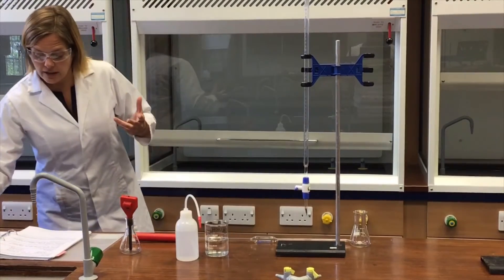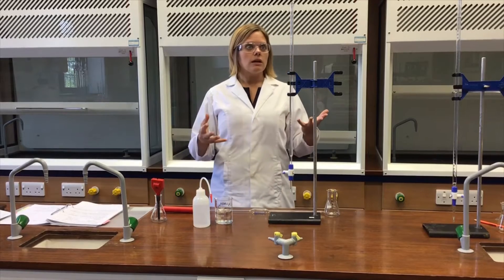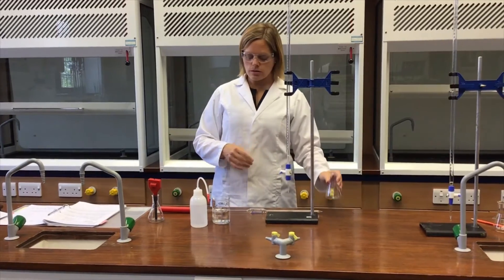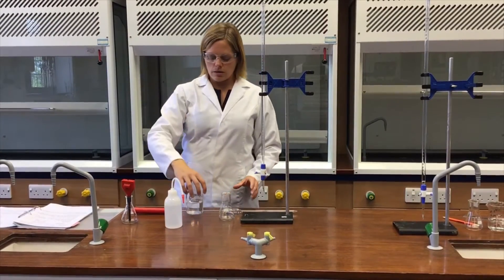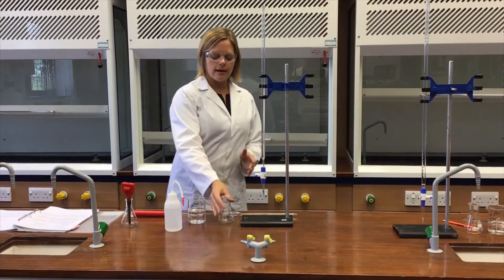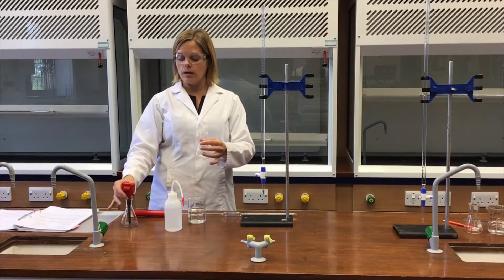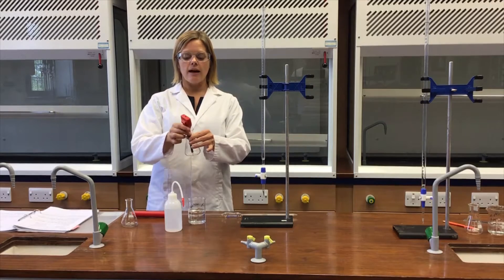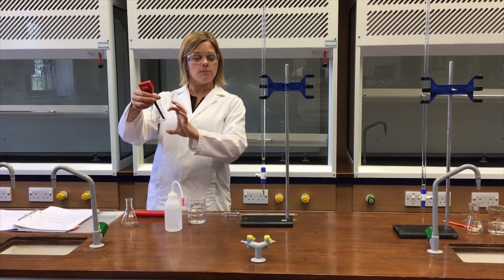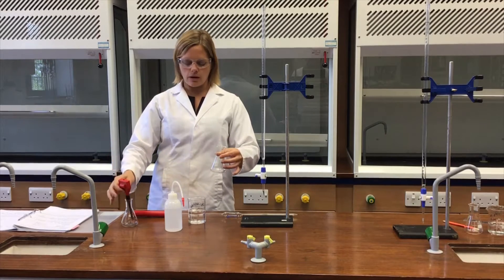The first experiment requires us to investigate the change in pH when we add sodium hydroxide — which is in the burette here — to some ethanoic acid, which is down here. I'm going to pipette 25.0 cm³ of ethanoic acid into a wide-neck, short conical flask. I've chosen this one so we can easily fit the pH meter in there, keep it under the burette, allow it to swirl, and so that the depth of solution is a bit higher than a normal 250 cm³ conical flask.